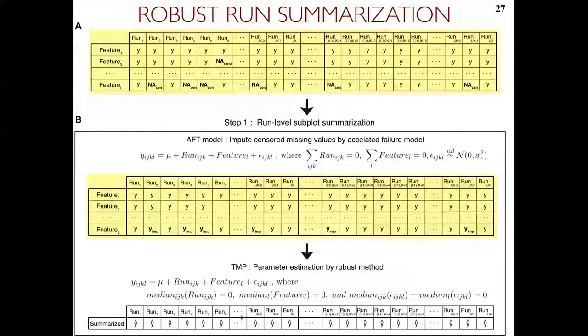But this part is important for two reasons. One is if we want to continue talking about differential abundance, so now we will take this data structure, and we will talk about time course, paired design, and all of this, and we will get p-values. At the same time, if you want to do other things, for example machine learning, biomarker discovery and predictive methods, or clustering and drawing heat maps with proteins versus runs, you can take these values as is, not do any statistics, and just use one number per protein per run, these summarized values, as input to machine learning or as input to clustering. So you would essentially have one row like this per protein.